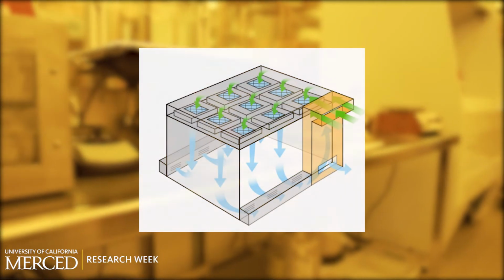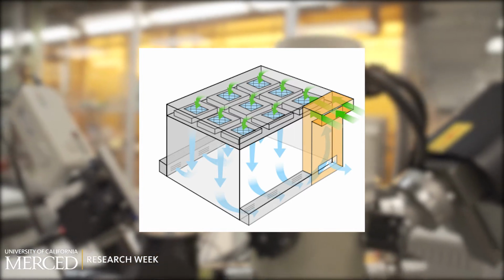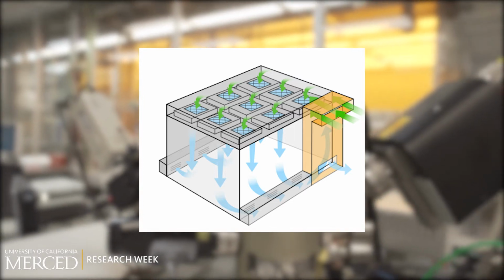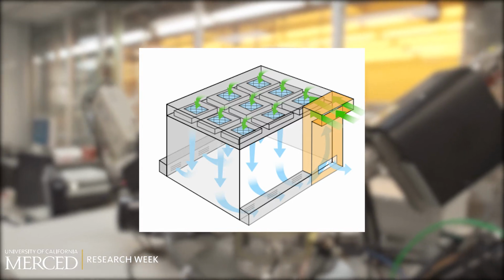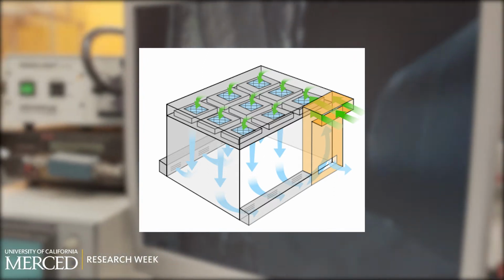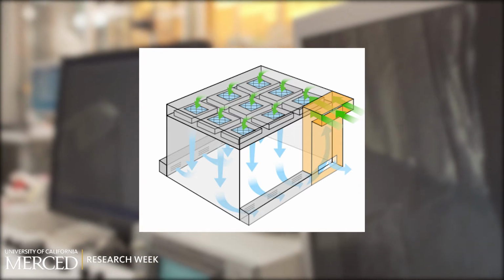How does a cleanroom work? Essentially, cleanrooms work to remove pollutants, particles, and contaminants from outside ambient air. Outside air is first circulated to a filter system. The filters then clean and decontaminate the outside air according to their specifications. The filtered air is then forced into the cleanroom. Additionally, contaminated air within the cleanroom is forced outside the room by registers, or it is recirculated back into the filters and the process restarts.